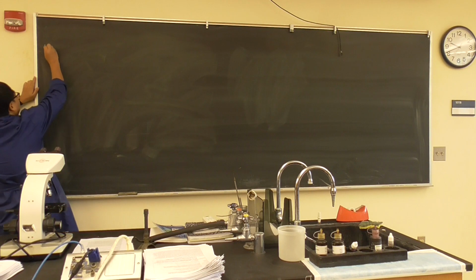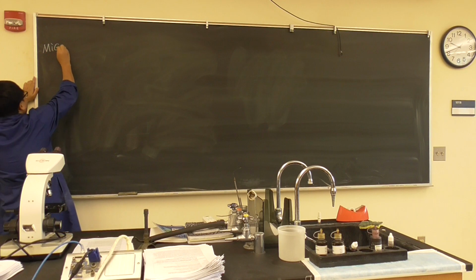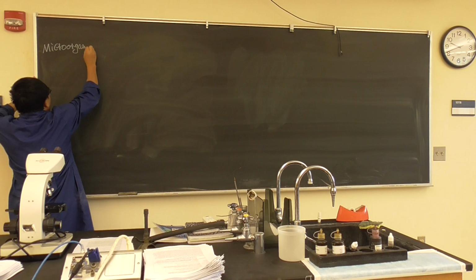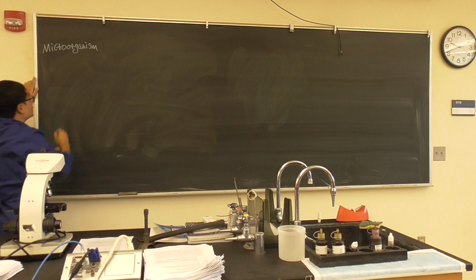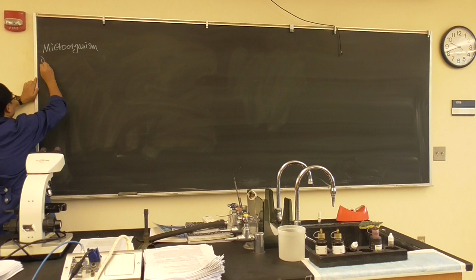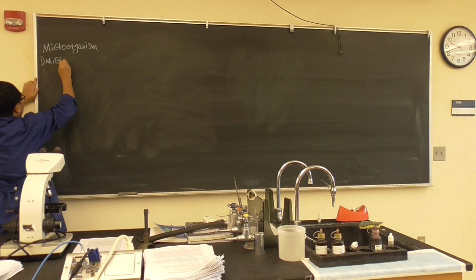So, first thing, microorganism. Okay, we were talking in the lecture, microorganism is too small to see by naked eye. So we need a tool which is called microscope.